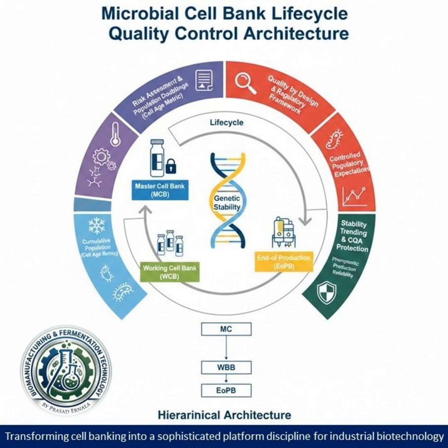So this whole incredibly complex design, from temperature mapping a freezer to that formal EOPCB stress test, it's all about ensuring absolute comparability and genetic fidelity across decades. It ensures that the drug you harvest 5 years from now, seeded from a high-generation WCB, is functionally and genetically identical to the material you made today from a pristine MCB.